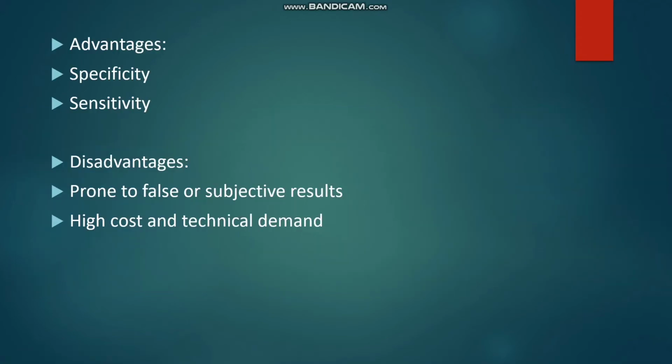Advantages of Western blotting. Specificity and sensitivity is the main advantages of Western blotting. Disadvantages includes it is prone to false or subjective results, and also it has high cost and technical demand.